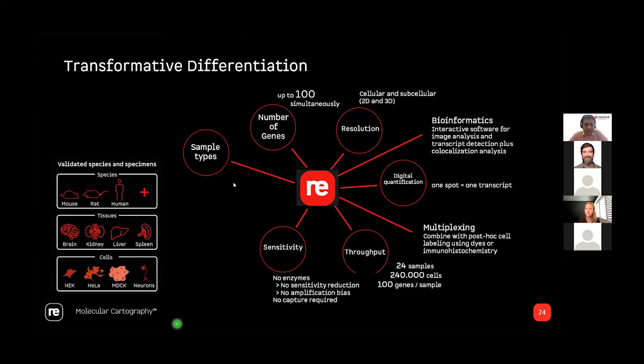Yeah, absolutely. So again, you have to be careful. Technically and theoretically, of course, you can combine it, but it depends from antibody to antibody. So the antibody needs to be validated and so on. Again, sample preparation methods can be different, whether it is fresh frozen, paraformaldehyde fixed, or FFPE, and so on. So in principle, yes, but of course, we go case by case here.